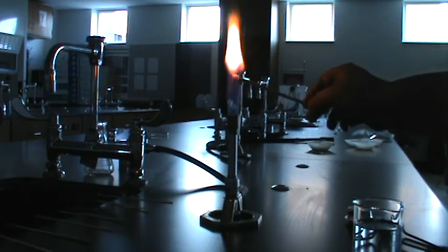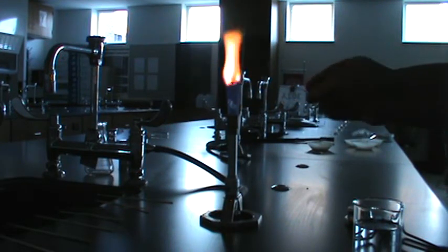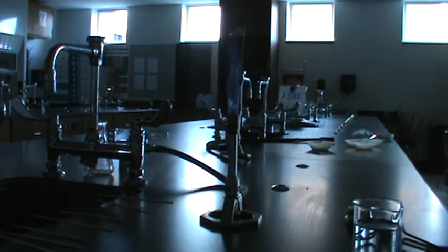So you see how it changes color? That's the color of sodium. Let's try another one. Next one is iron 3 nitrate, or we're going to look at what iron is going to give us as a color.